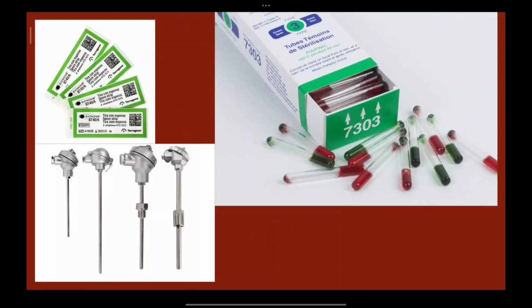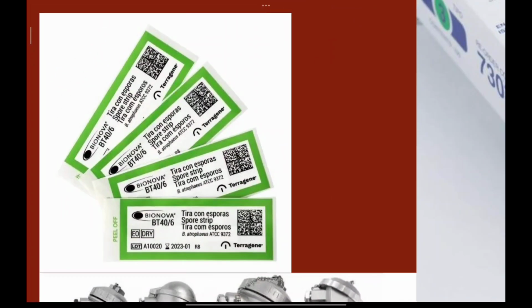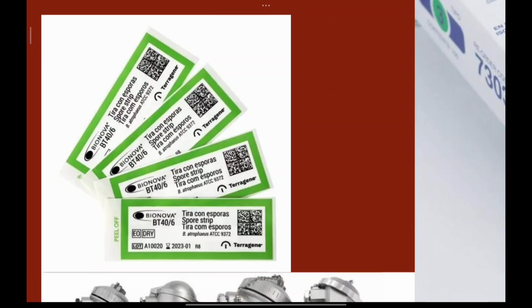So here is an image of the different indicators that are being used inside the hot air oven. Firstly, the strips that are used for checking the sterilization. These strips are going to determine the spores that are being exposed to sterilization and the death of the spores.